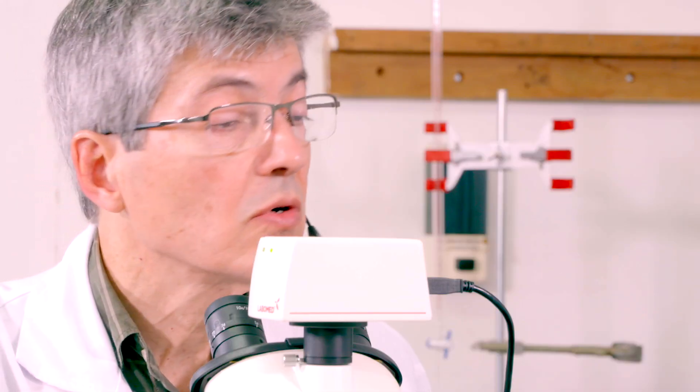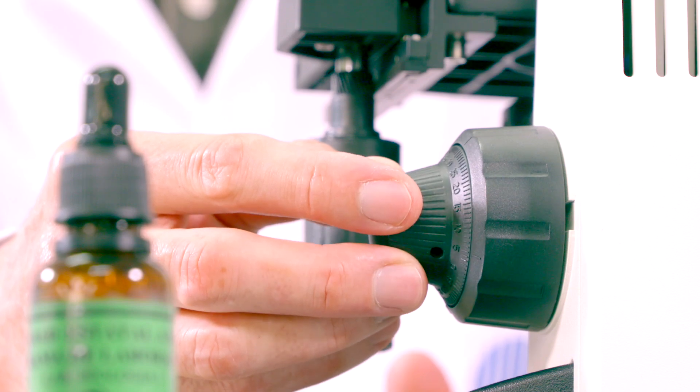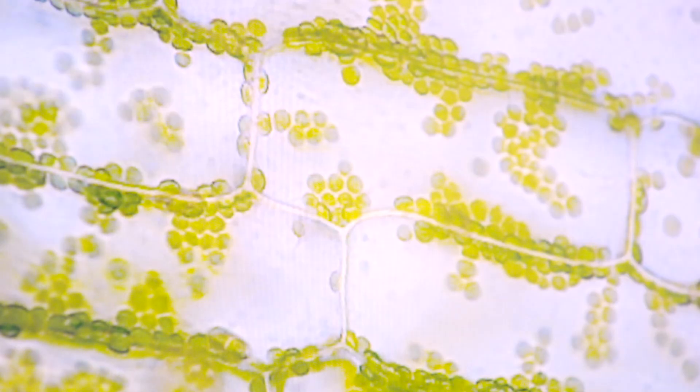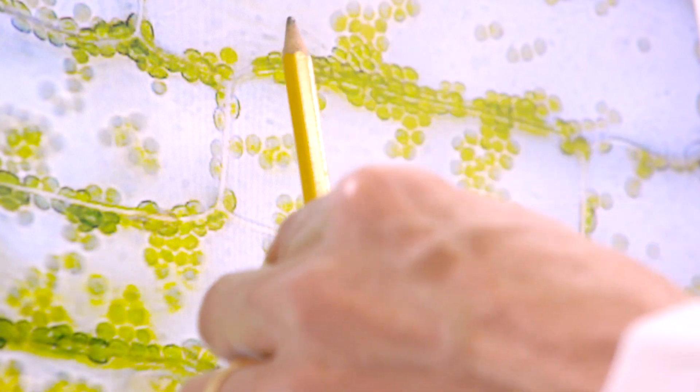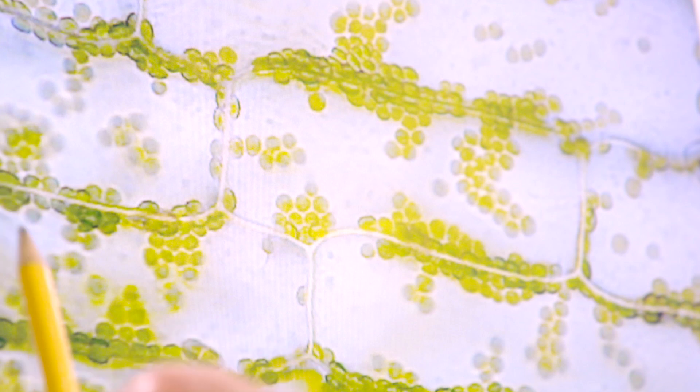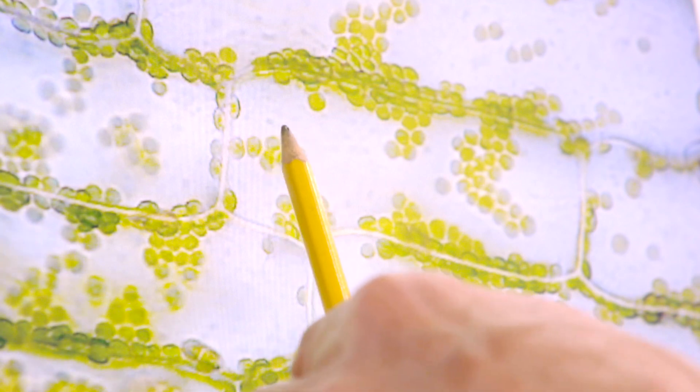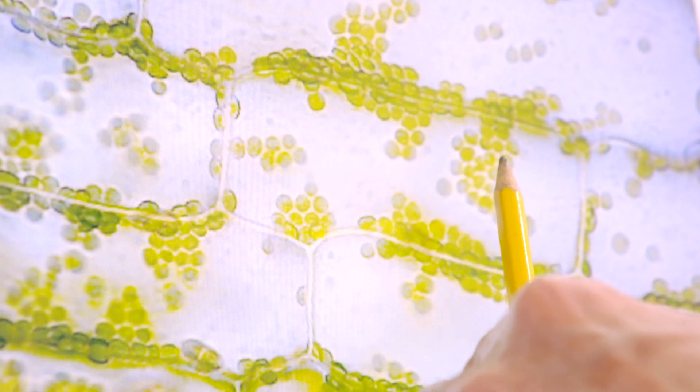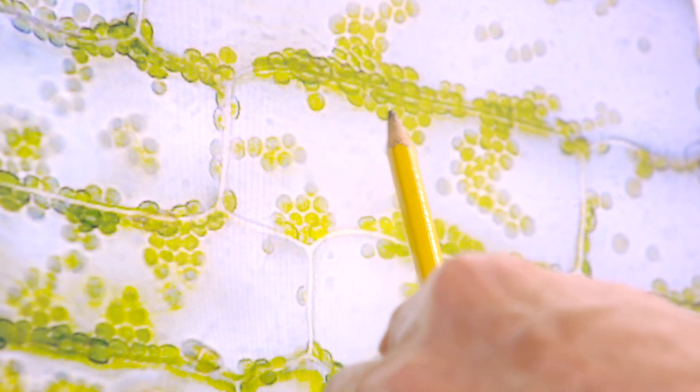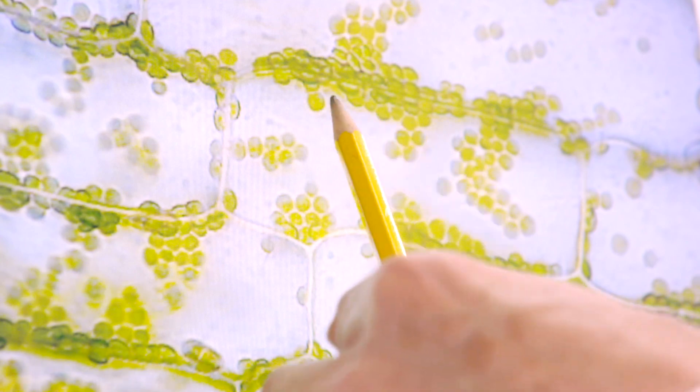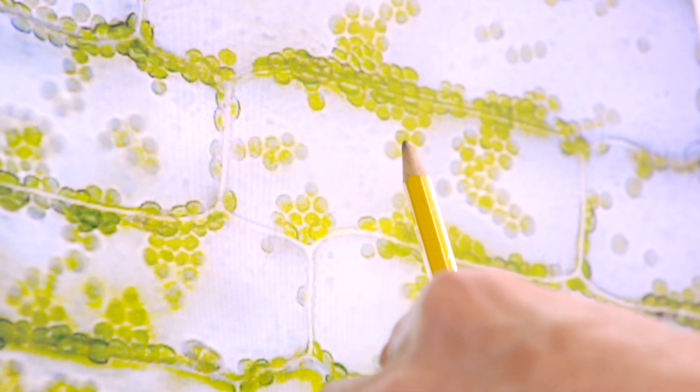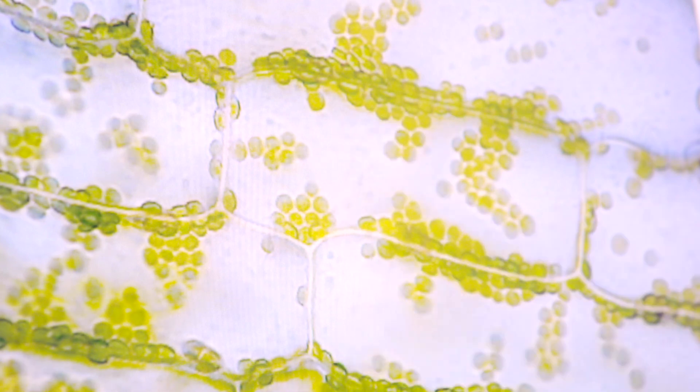Y, de nuevo, con la perilla micrométrica, vamos a poder observar en mayor detalle nuestras células. Excelente imagen. Vean cómo, este rectángulo que tenemos acá, esta es una célula, esta es otra célula. Y, los pequeños círculos que tenemos acá, verdes, pues son los cloroplastos. Esos cloroplastos están llenos de clorofila. Ahí es donde se realiza la fotosíntesis en la célula. Y, los cloroplastos están ubicados en el citoplasma, dentro del citoplasma.